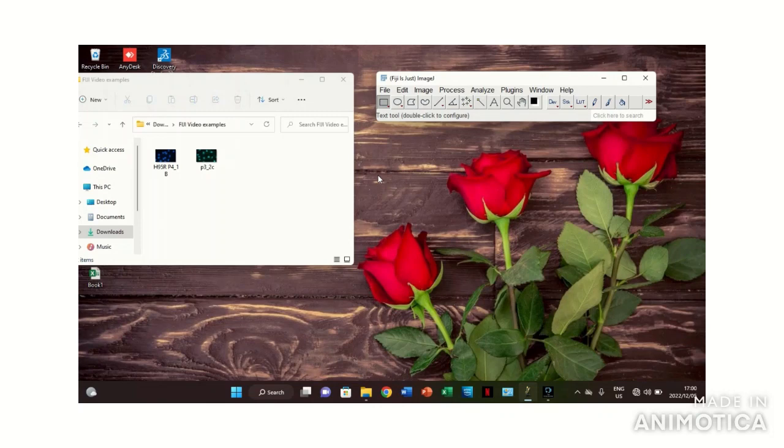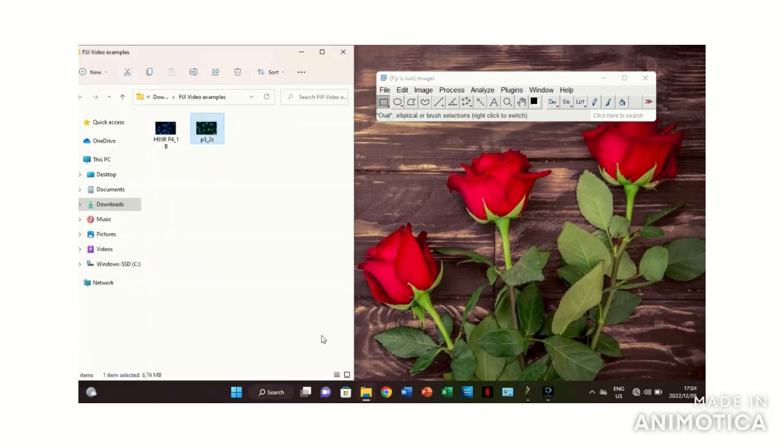And for this video, I will be showing you how to use FIJI or ImageJ to process your microscopy images. FIJI is a very powerful technique that can be used for various different types of processing, such as deconvolution, tracking of particles, analysis of particles, and many more. This video is focused on how to use FIJI to analyze your particles and how you can use it to segment cells that appear to be joining.